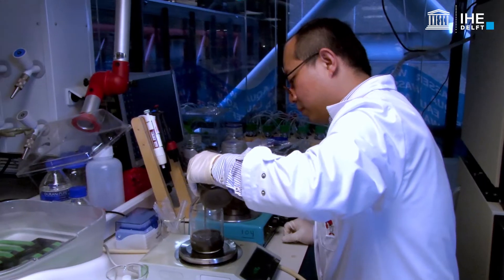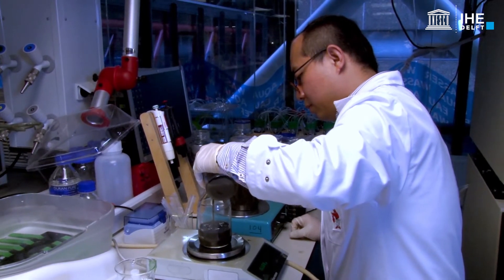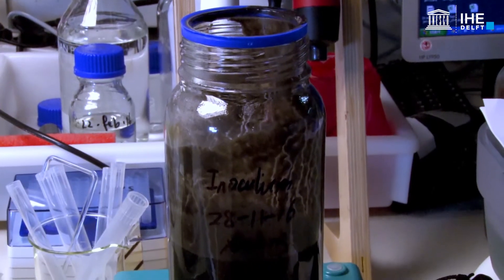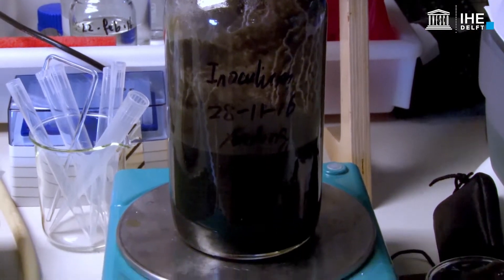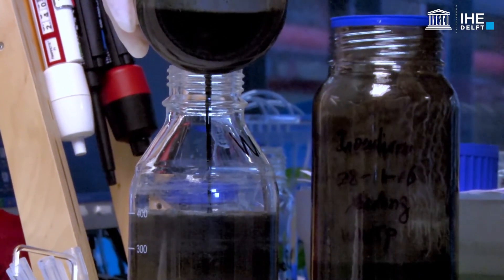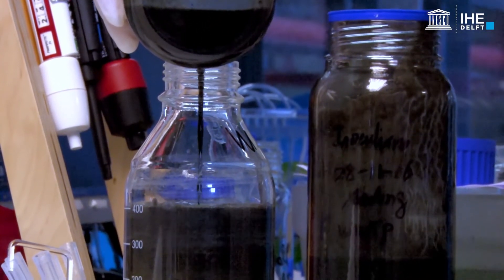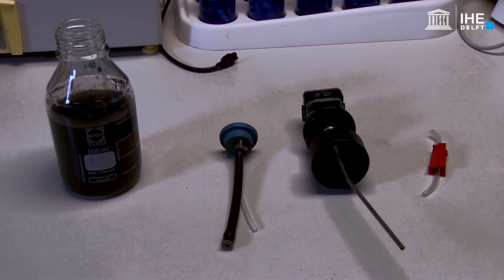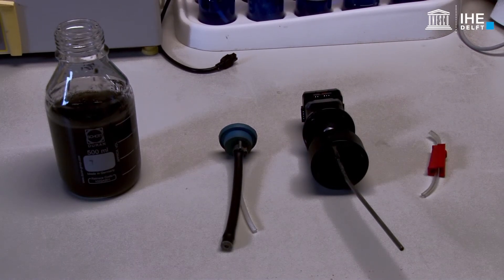As previously indicated, weigh and fill the concentrated activated sludge into the bottle. Add the calculated amount of inoculum into the bottle using a balance. Afterwards, as for the blank group, add the phosphorus buffer, macronutrient and micronutrient solution into the bottle.